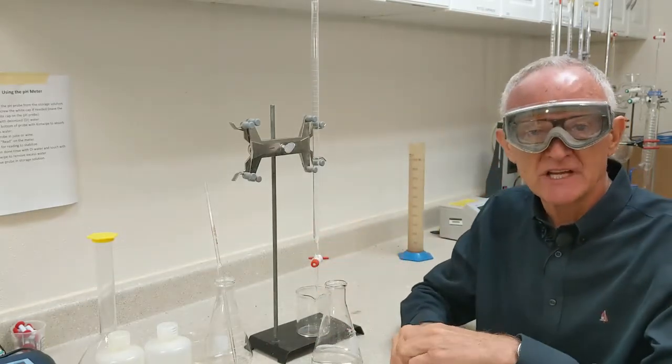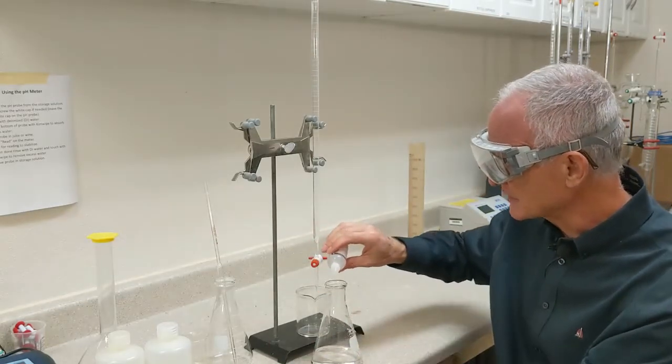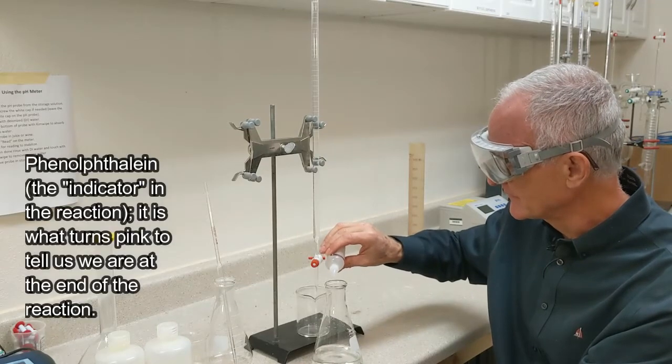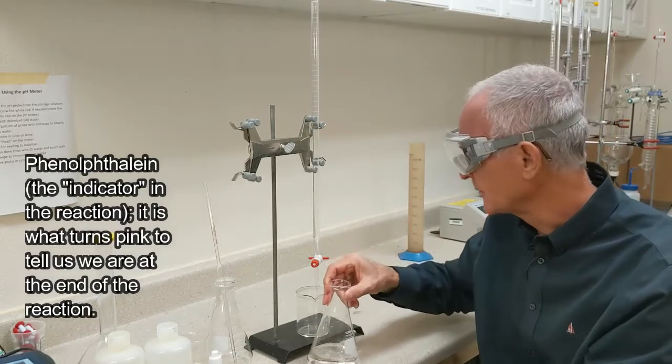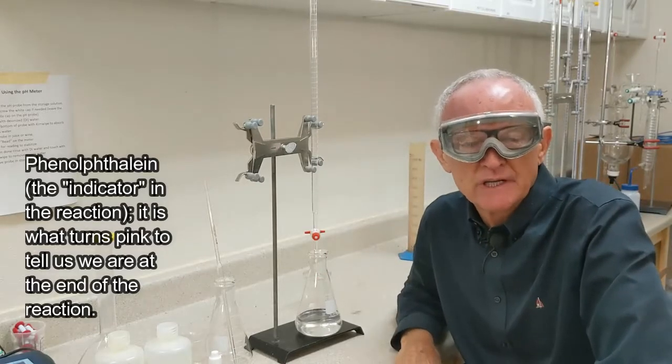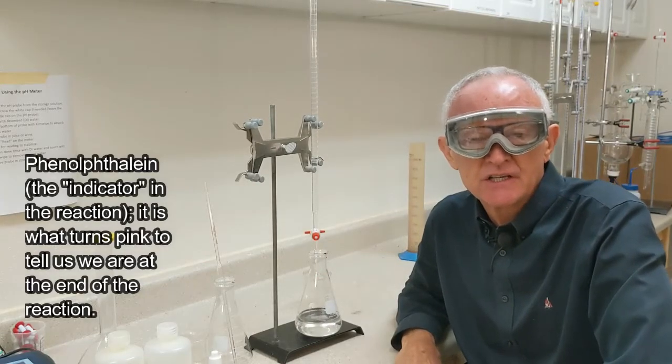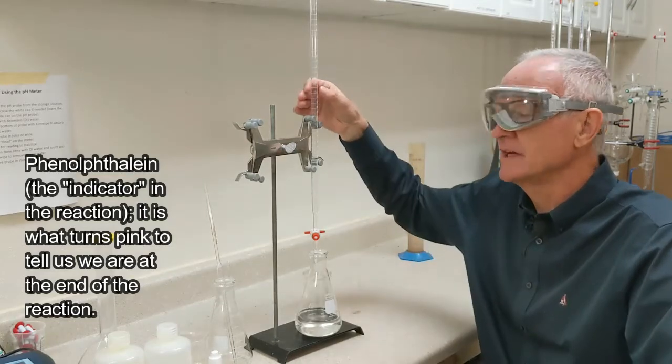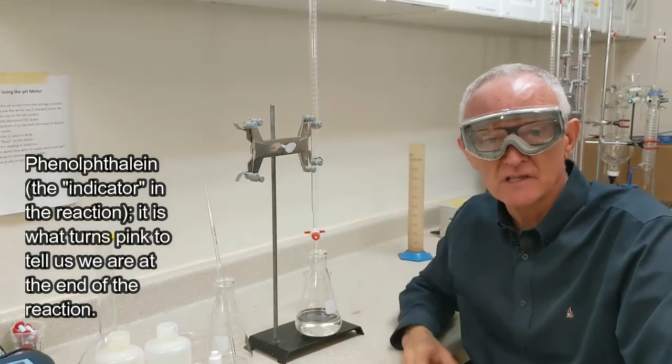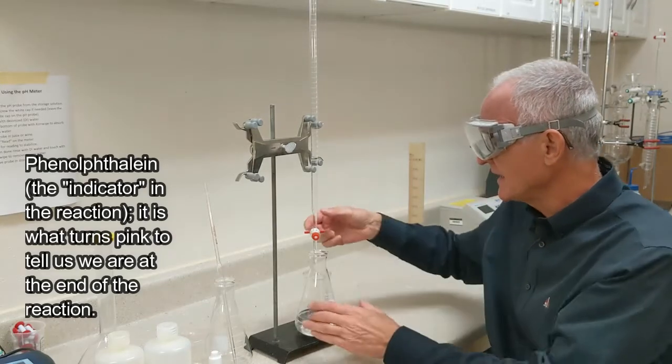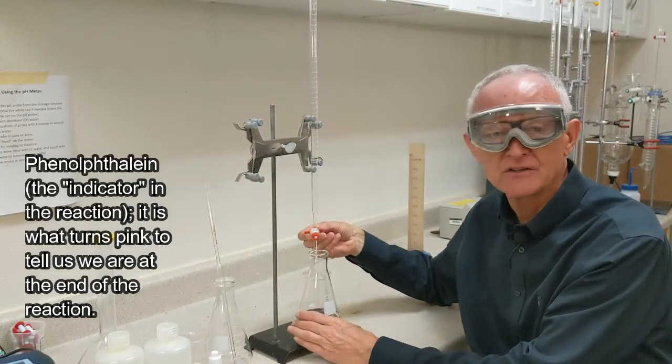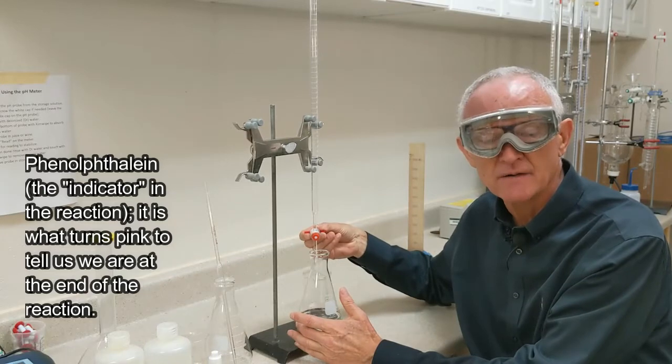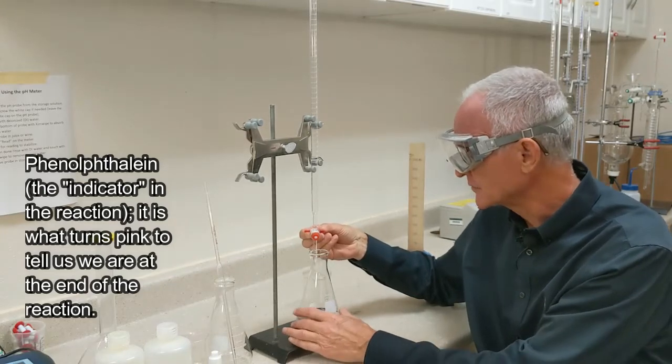So what I'll do first is add my four or five drops of phenolphthalein. Swirl that around a little bit. Now when you're first doing a titration, it's good to get used to how to drip the phenolphthalein or the sodium hydroxide in your burette fairly slowly into the flask.